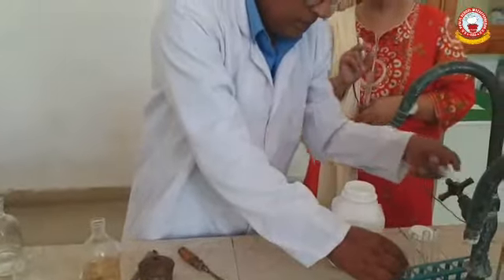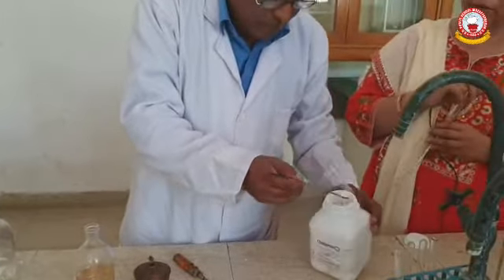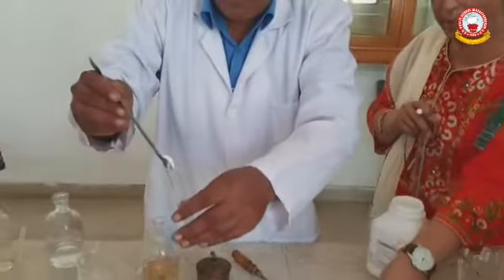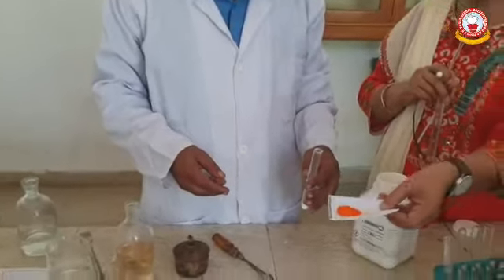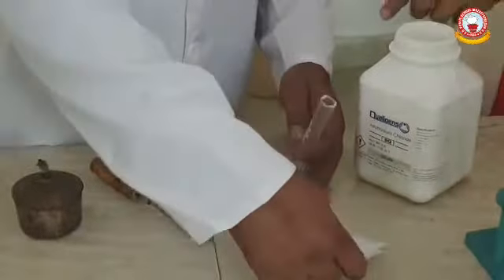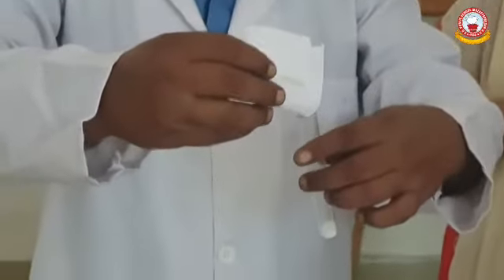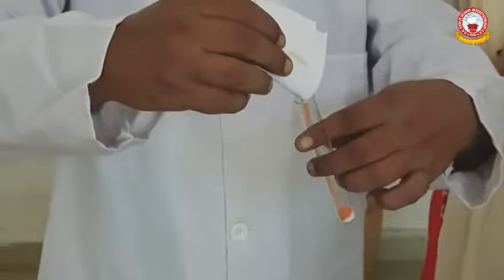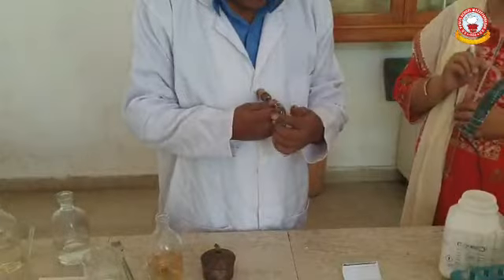Now we will do one more confirmatory test, which is known as chromyl chloride test, children, and in this we will require orange colored solid. You can see it, it is placed here, it is orange colored solid, which is known as potassium dichromate. We have taken the salt 1 part in the test tube, and we will add 3 parts solid potassium dichromate in the test tube, and now we will add concentrated sulfuric acid to this mixture.